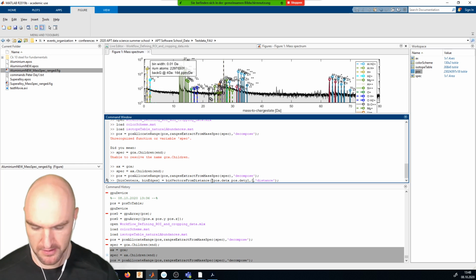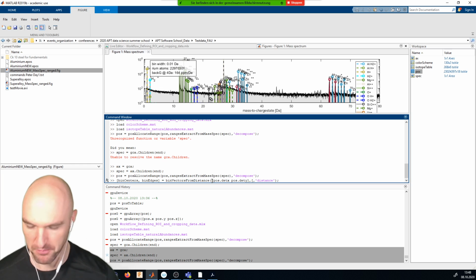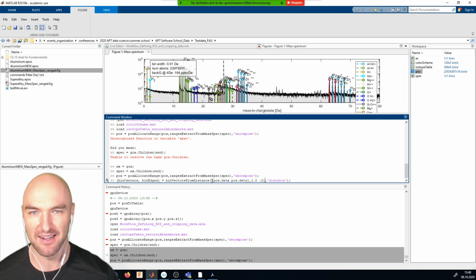Our bins are going to be, I don't know, this is a 40 millimeter detector, so 0.1 millimeter would be 400 bins. Let's say 0.2 millimeters. Usually anything much below 50 microns doesn't make sense anyway, because that's in the detector resolution range.